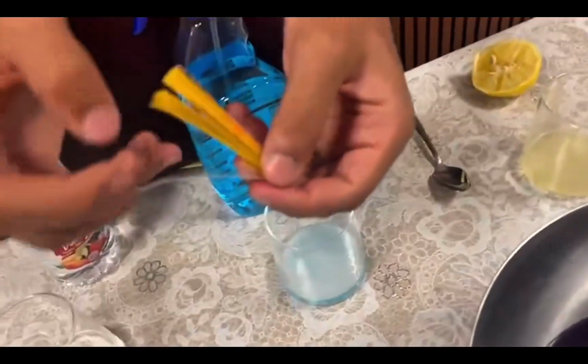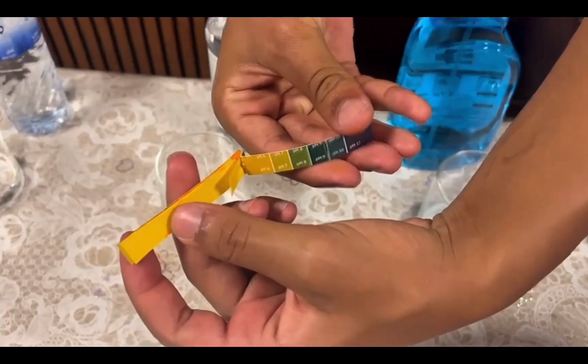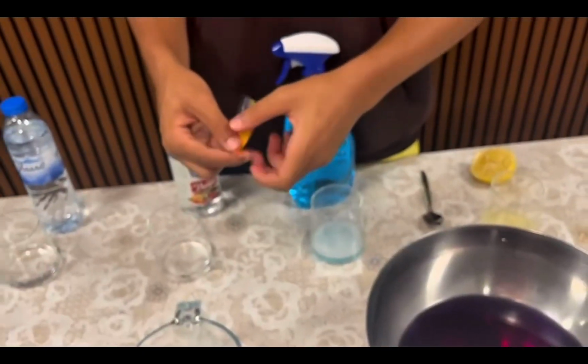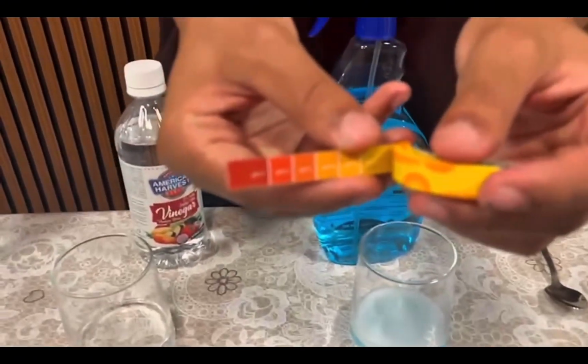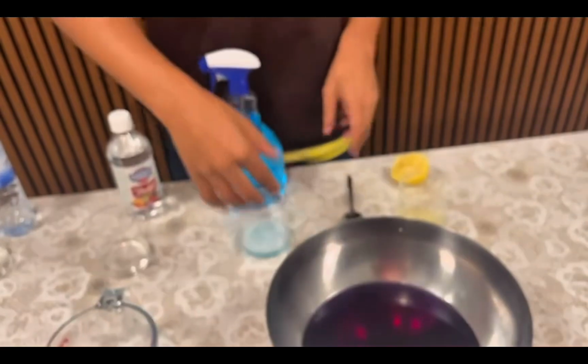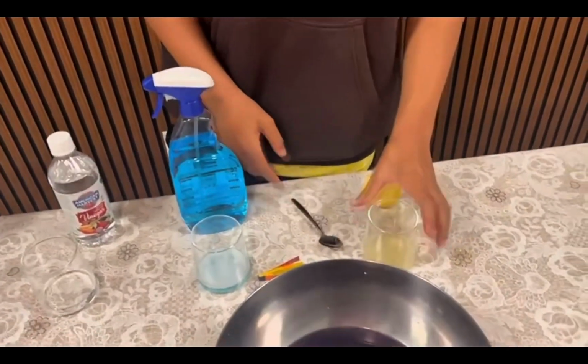Okay. Here is our pH scale lined up. If it's basic, it's going to be around the higher pH. And for the low pH, that's for acidic, more acidic. Anyways, throw it to the side. Here's our spoon to make sure everything is dissolved well.